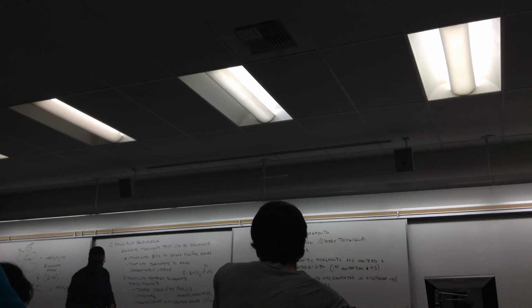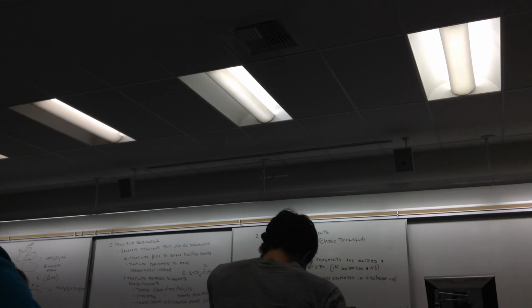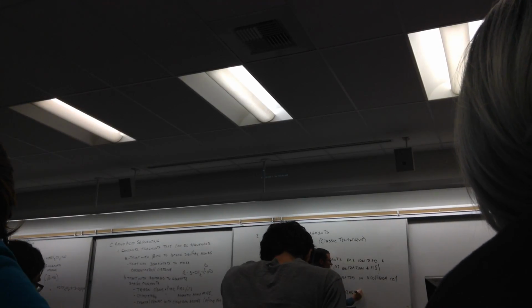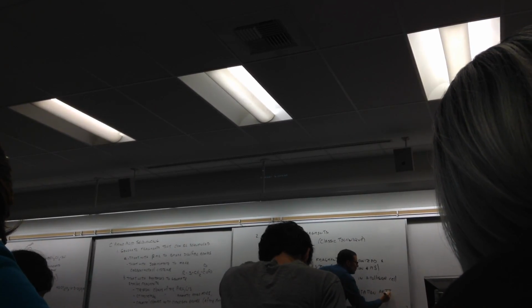And so the final thing is computer analysis of fragmentation pattern to deduce the sequence.